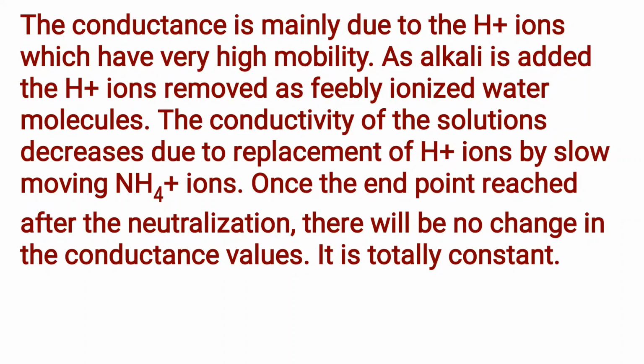The conductance is mainly due to the H+ ions, which have very high mobility. As alkali is added, the H+ ions are removed as feebly ionized water molecules. The conductivity of the solution decreases due to the replacement of H+ ions by slow moving NH4+ ions. Once the endpoint is reached, after the neutralization, there will be no change in the conductance value.